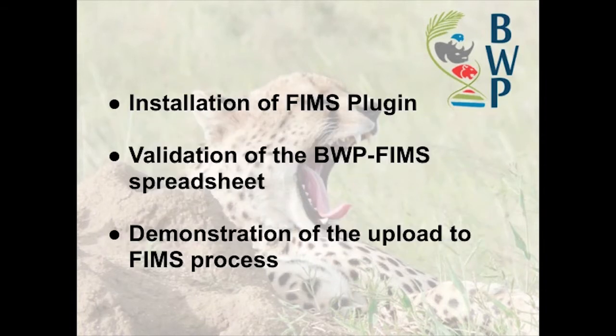This tutorial will introduce you to the FIMS plugin and familiarize you with the validation and upload process. We will explain how to install the plugin, we will explain the spreadsheet validation process, and finally, we will demonstrate how to upload the validated spreadsheet into the FIMS database.